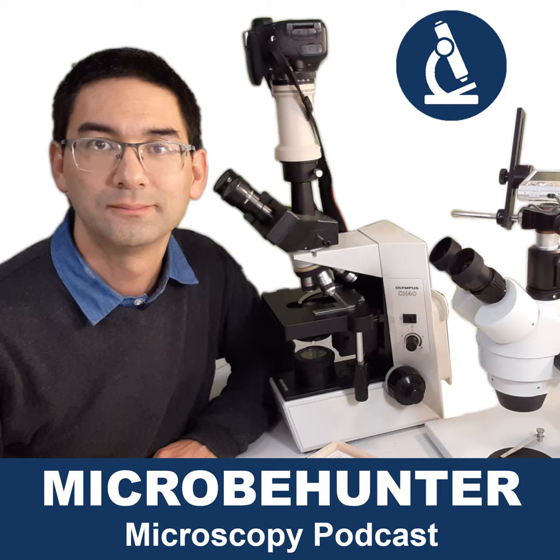So basically, you can, of course, look through the microscope itself, through the eyepieces. And if you have a phototube, you can have a microscope camera on the phototube. If you do not have a phototube, a so-called trinocular head, then you can take one of the eyepieces out and insert a microscope camera, and this camera is then directly connected to a laptop. This works, and it will give you a live image. It has advantages and disadvantages, of course, and I'm going to talk about this.